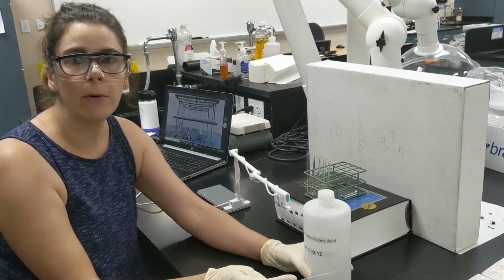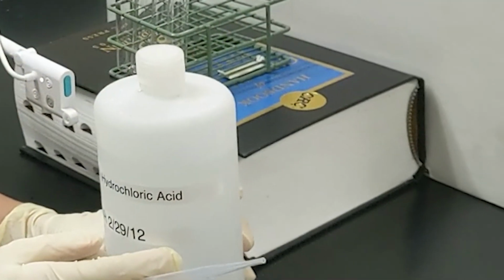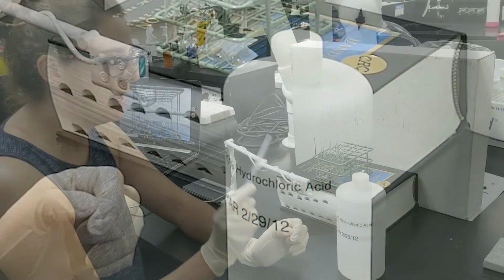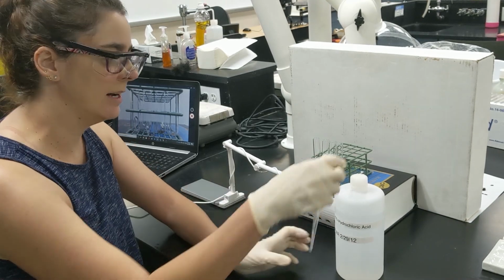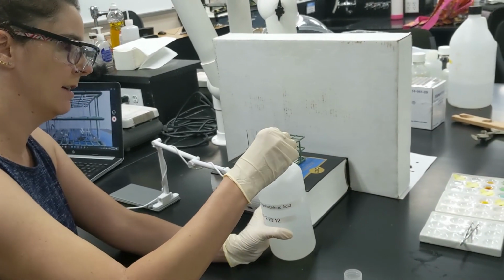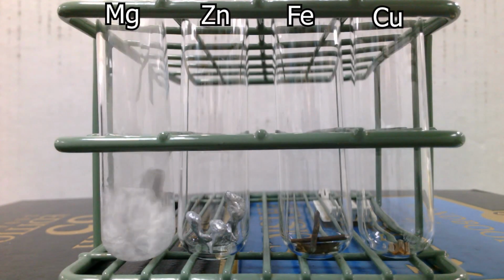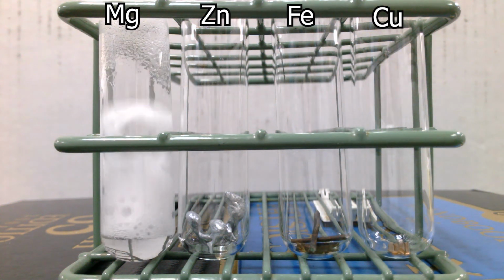So to that, we're going to add our solution of 6 molar hydrochloric acid. And we're going to observe if the metal and the acid are undergoing a single displacement or a redox reaction. Okay, so let's do this. Make sure you record your observations.